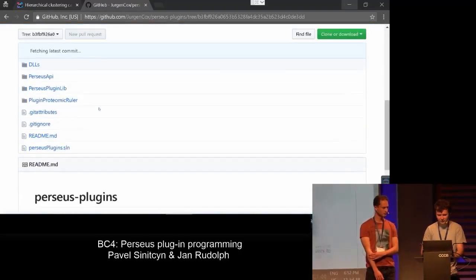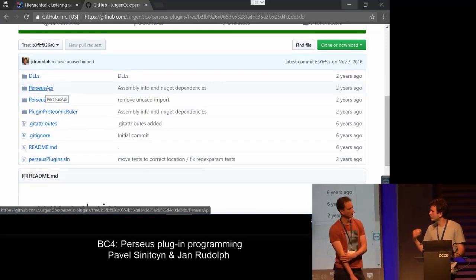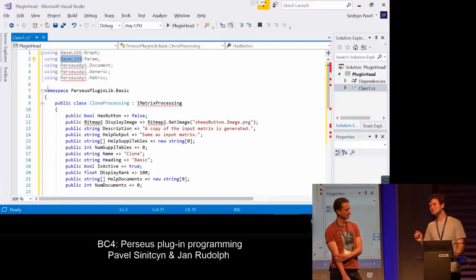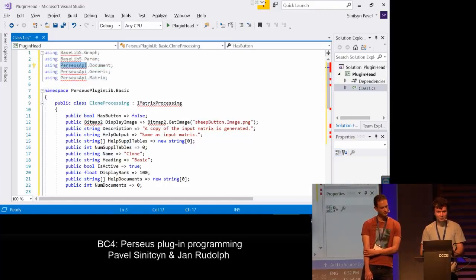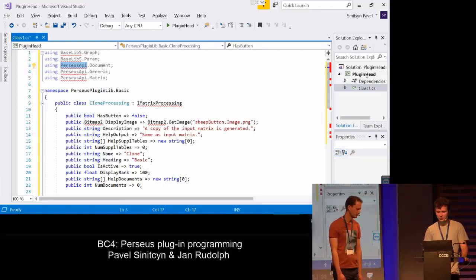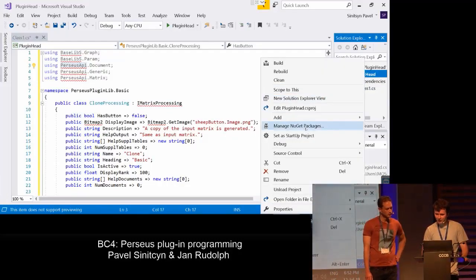The code itself is written here, but it would not be really useful to load it, build it, and copy it to our project. Yeah, there must be some automated way, right? Two years ago there was no such method, but now you can do it. Usually, if something is missing, you just find it in the NuGet packages shop.